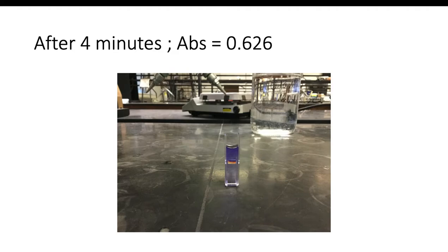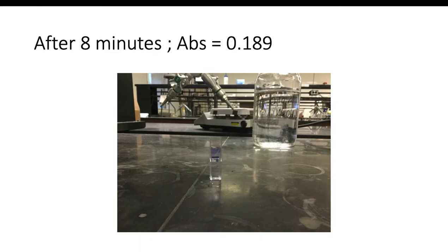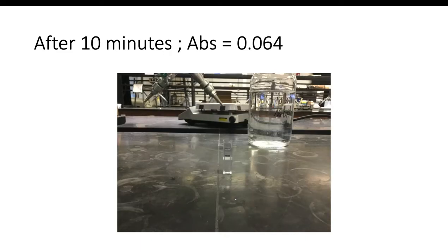I do apologize, the cuvette got turned 90 degrees. It's the same cuvette, it's the same reaction. But we see its absorbance down to 0.626, and we see that number continuing to decrease over time as our solution gets lighter and lighter. And eventually, if we go all the way to 10 minutes, we see our solution is pretty much clear.